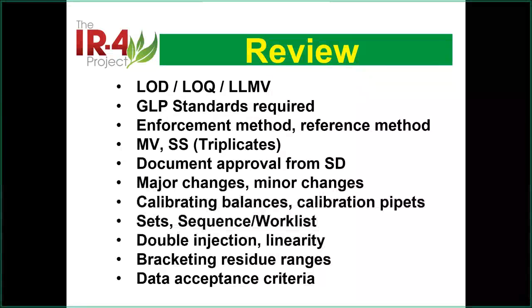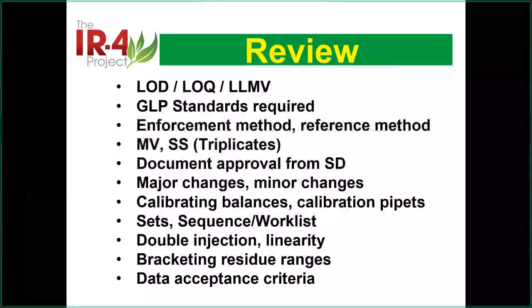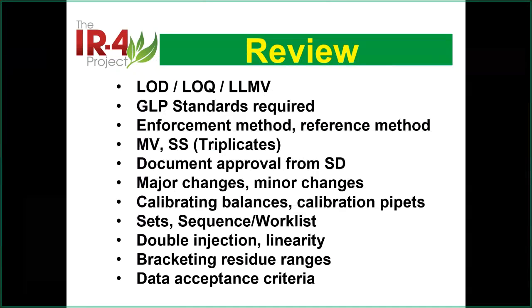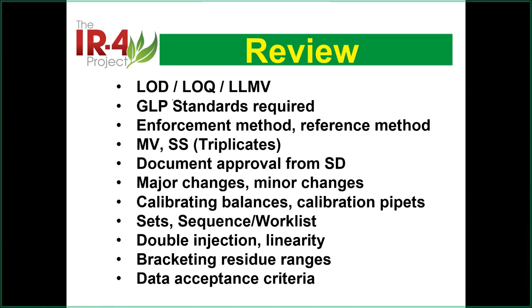So we learned yesterday about lab analysis, related to GLP, related to lab practice. We talked about a lot of things about LOQ and LLMV, and we use these very commonly to explain the method. So this is a requirement: you have to do enough lowest level spike levels in order to do the statistical calculations.